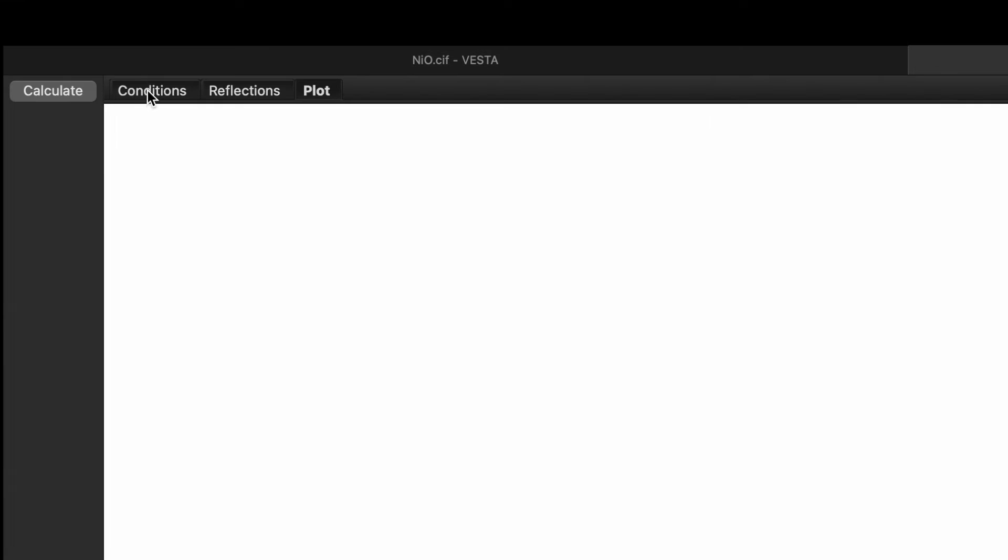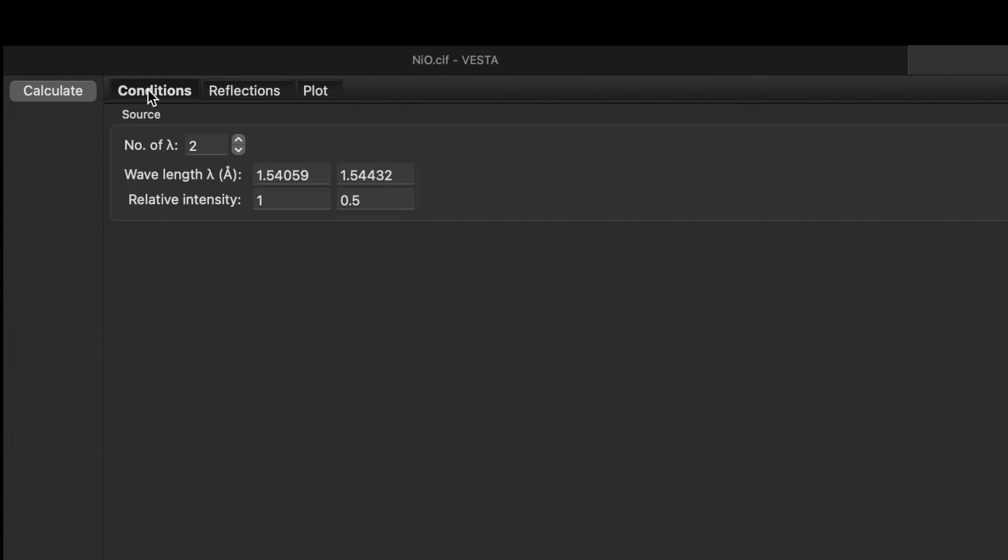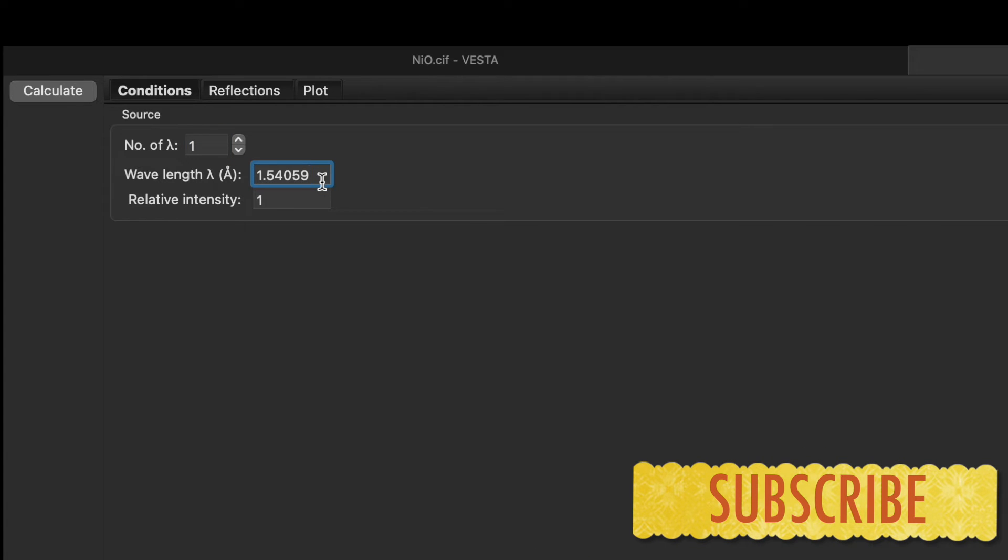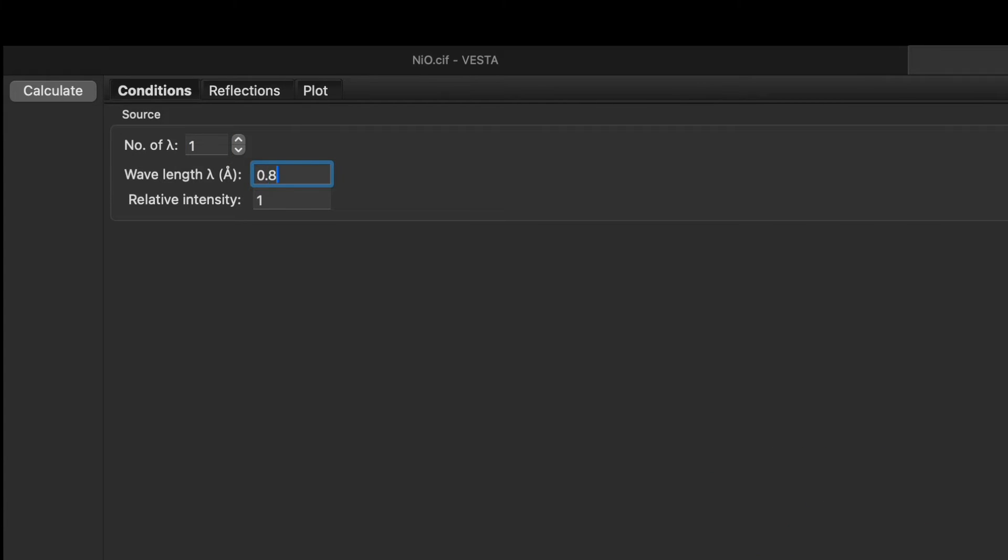In this window you can go to the conditions. In the condition initially it shows number of wavelength is 2, so reduce it to 1. And here we need to type the wavelength which is 0.82656 and then click on calculate.